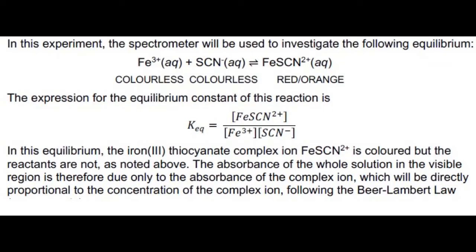In the first part of the experiment, you will be qualitatively examining the equilibrium shown here. You will be mixing two colorless reactants, which will react to form a colored product.